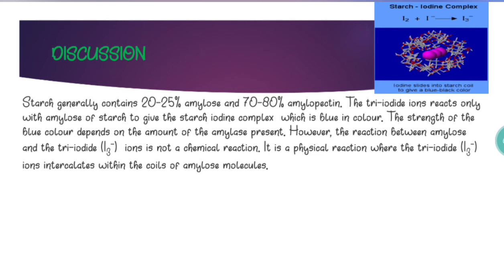Now coming to the discussion, we have already discussed that the iodine, the triiodide ions, will react with the amylose of starch and not the amylopectin.